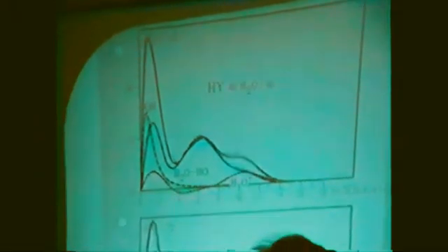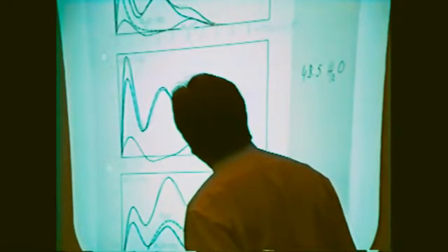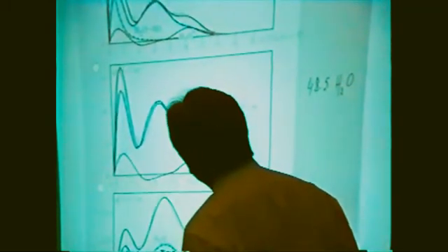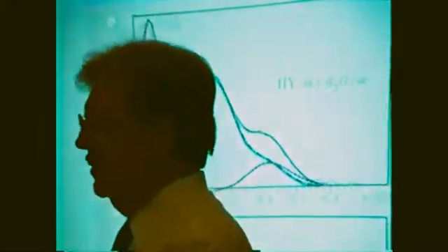And when we adsorb exactly the same number of water molecules, 48 molecules, we see that we have in dotted line the experimental spectrum, in a full black line the simulation, and to get such simulation, we need two lines, the red one corresponding to the hydroxonium ion, and the blue line corresponding to the hydrogen bond between water molecule and OH group.